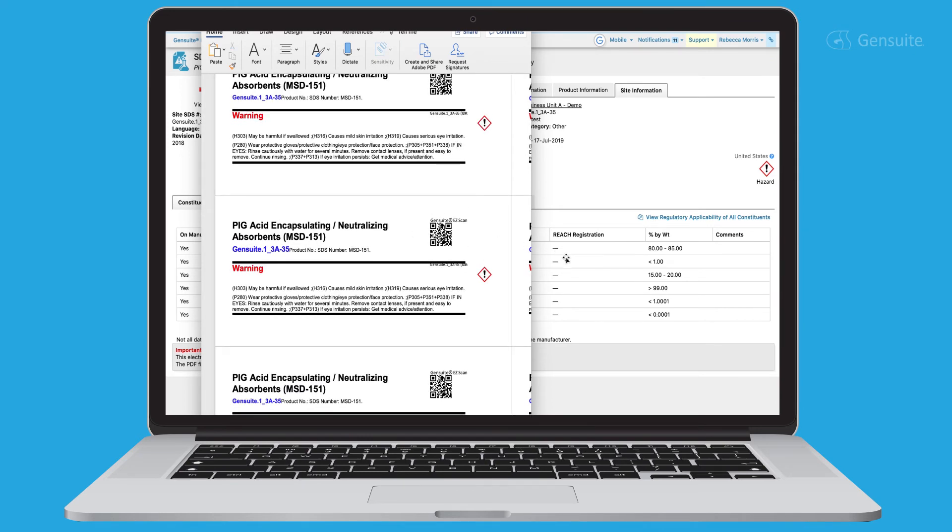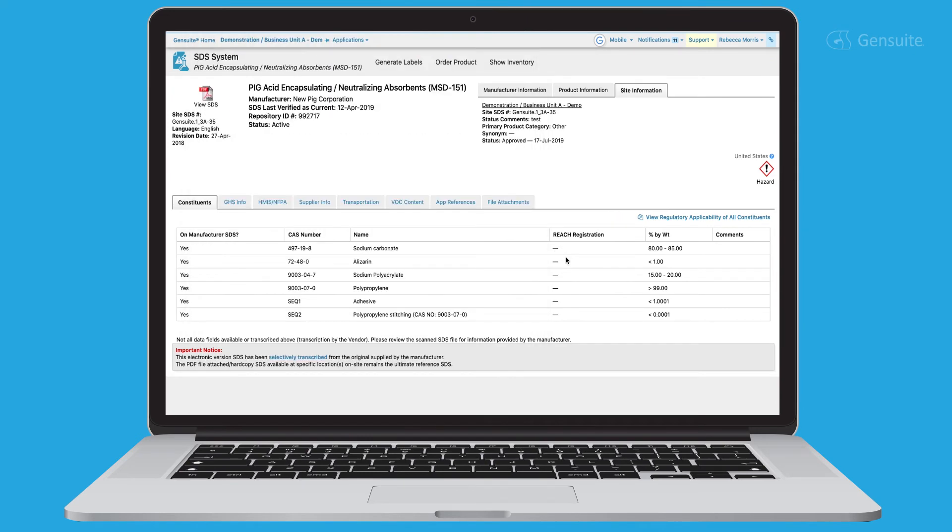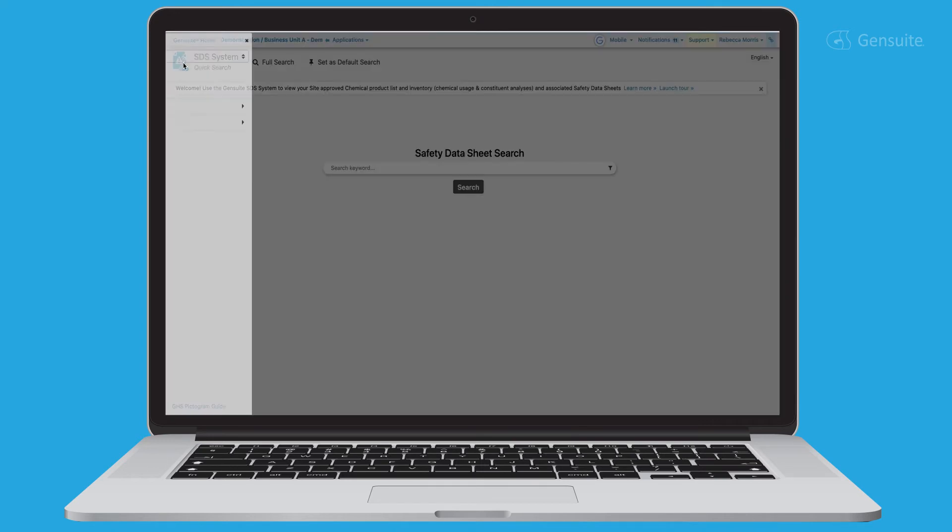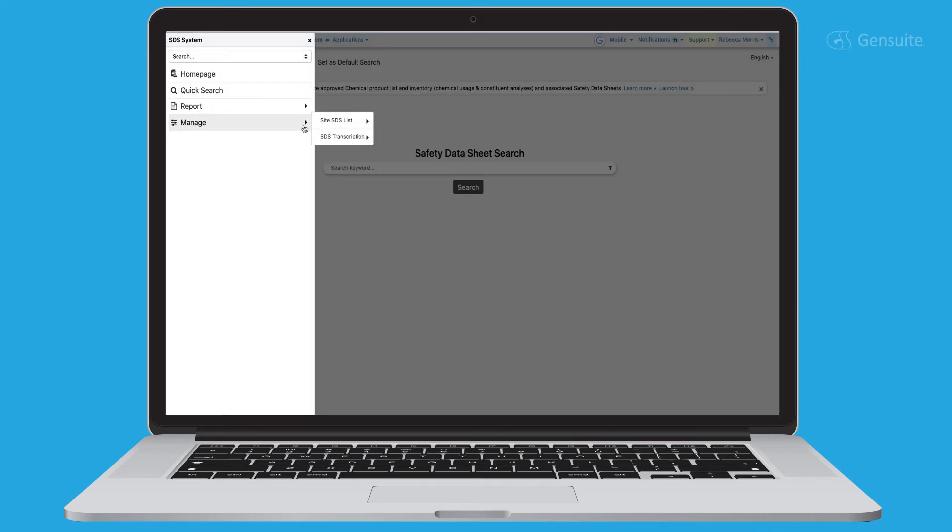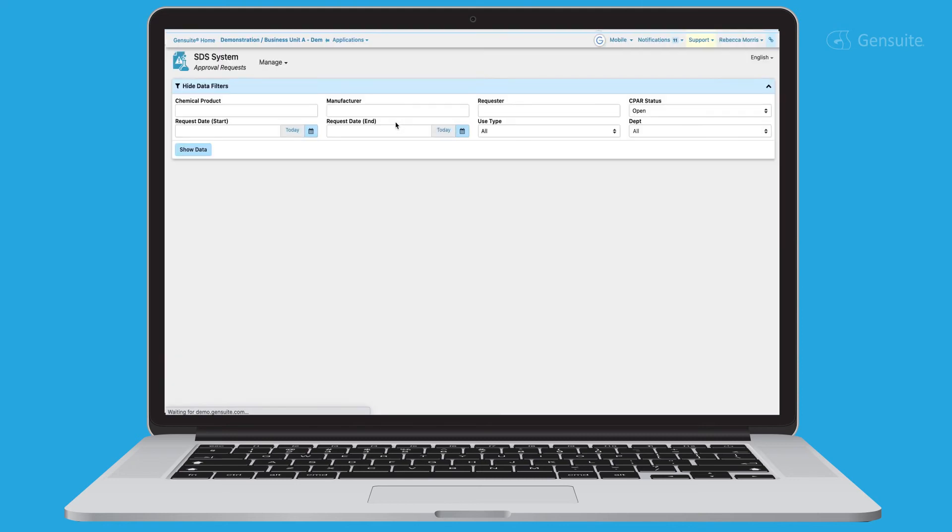Not finding an approved SDS for the product you're looking for? No problem. Simply request a new chemical product, fill in the details and submit. A notification of your request will be sent to the site administrator to approve or reject.